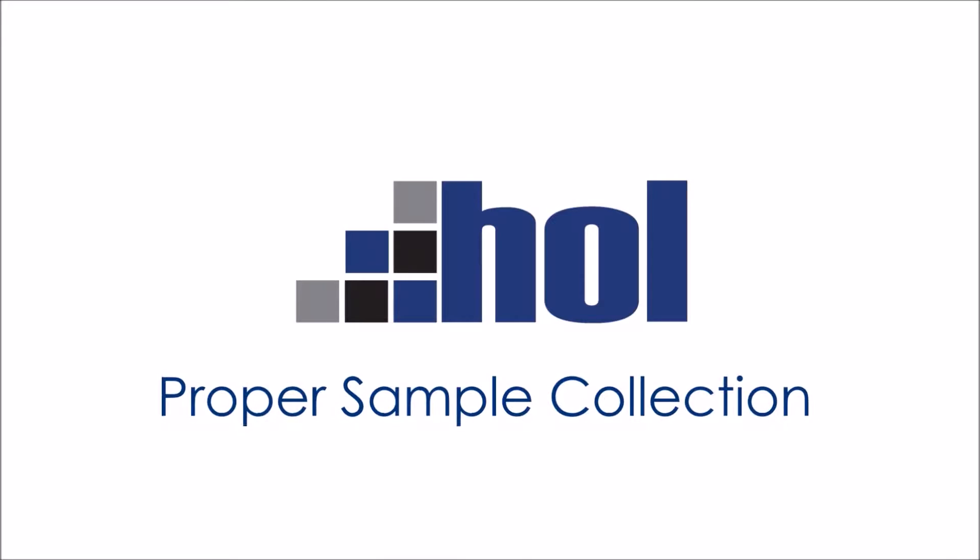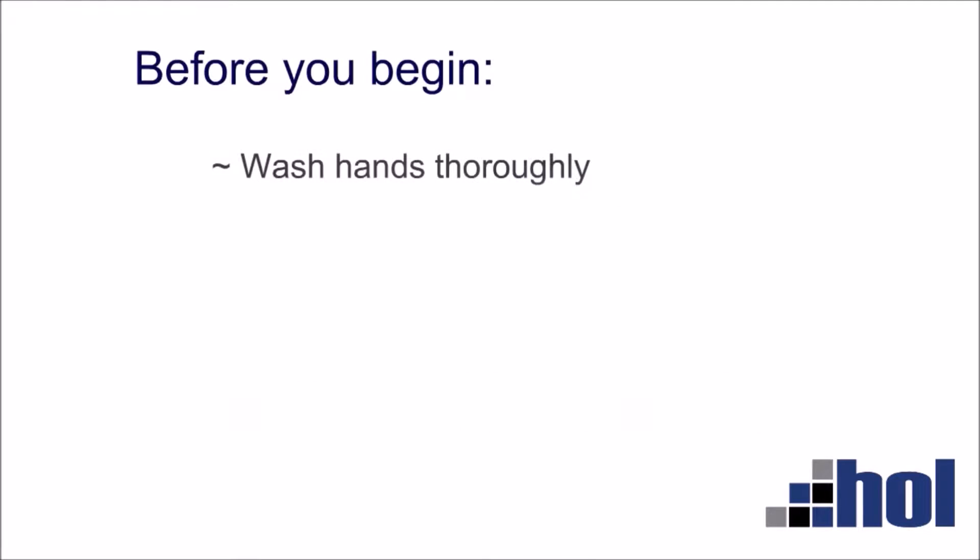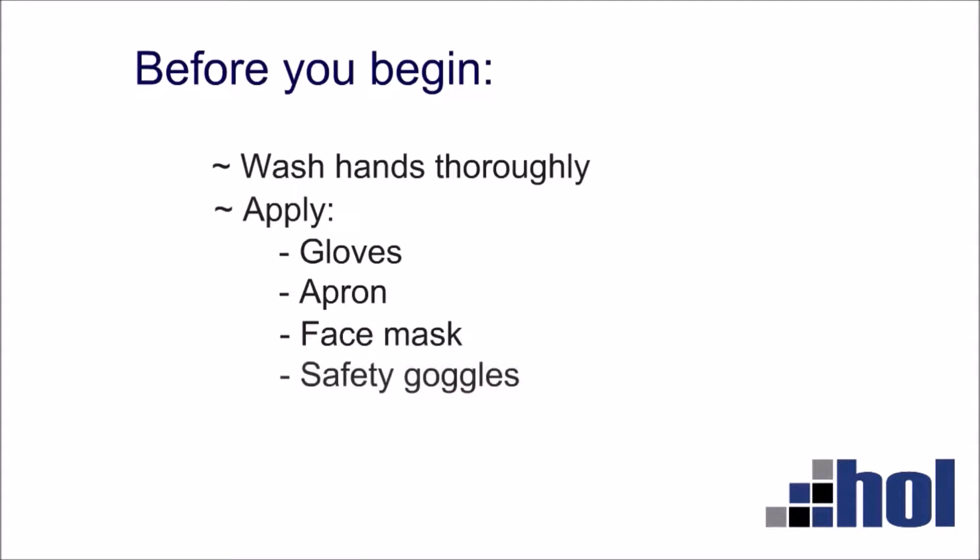Proper sample collection. Before you begin, wash hands thoroughly and dry with paper towels. Apply gloves, apron, face mask, and safety goggles.